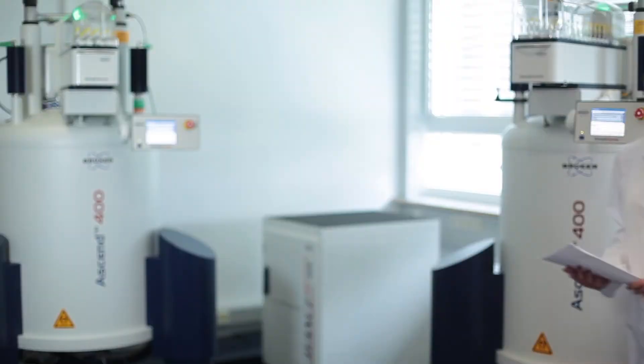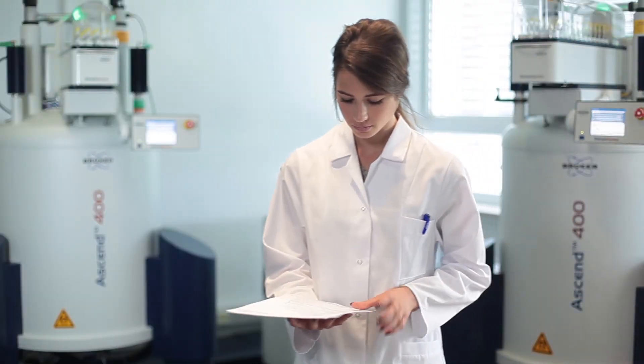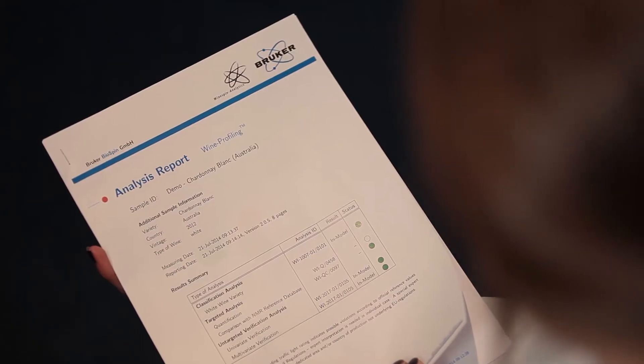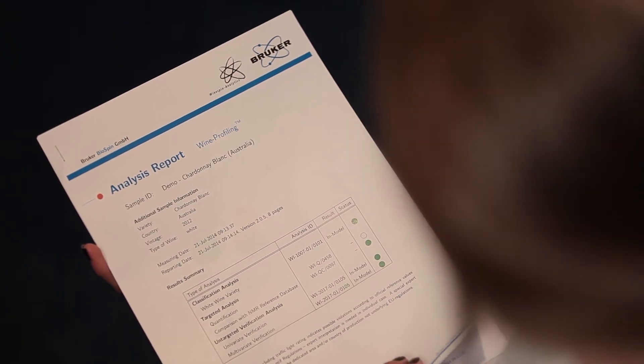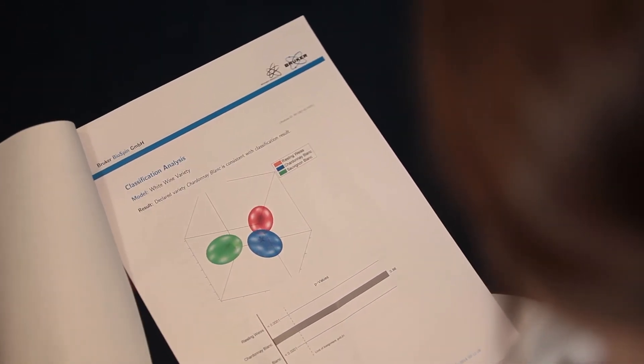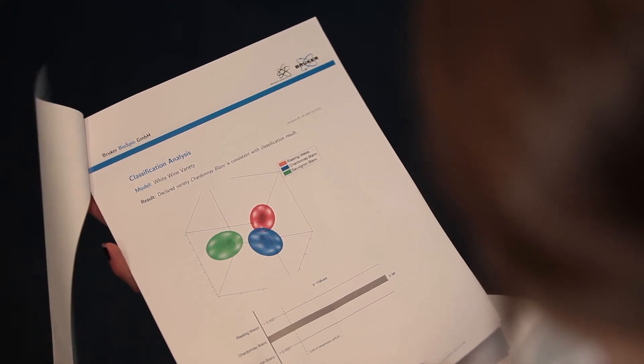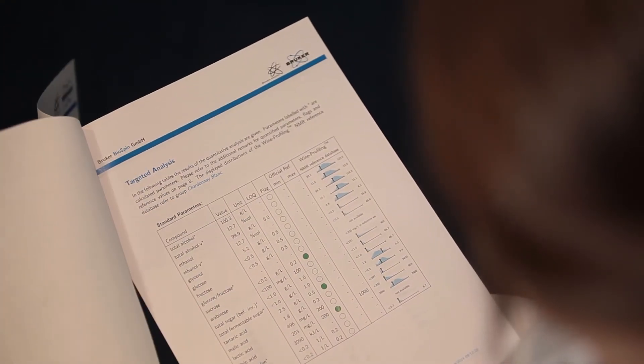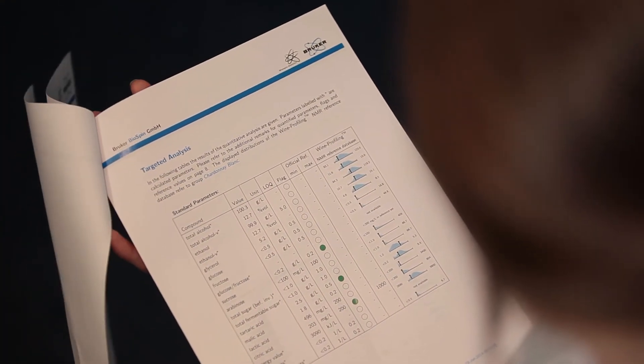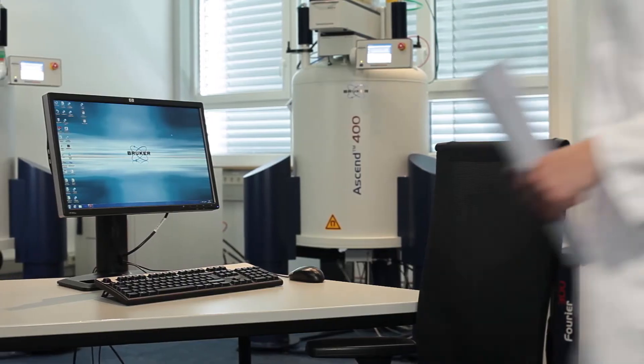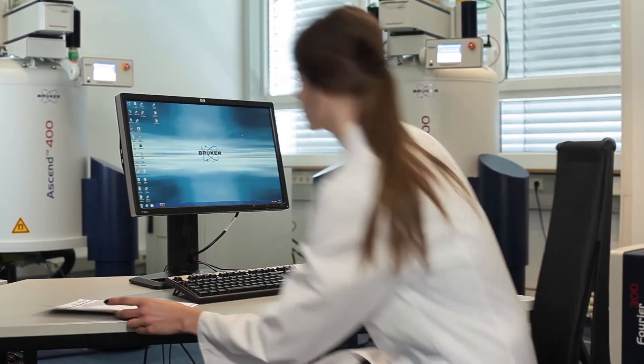An application-specific report is generated as the last step in the automatic analysis sequence. In this case, a wine report was generated. It contains the quantification results and statistically-derived authenticity parameters such as geographical origin, grape variety and vintage year.